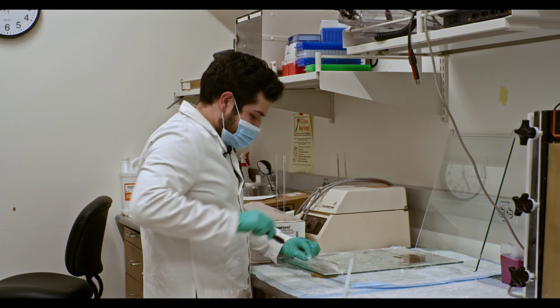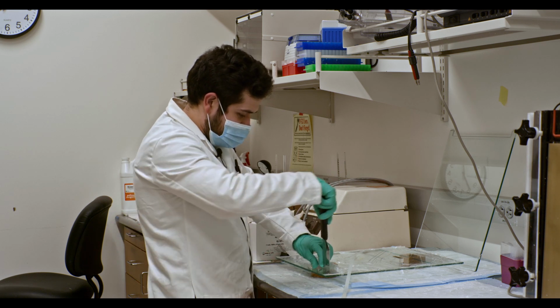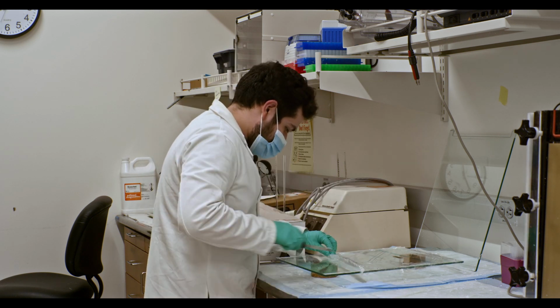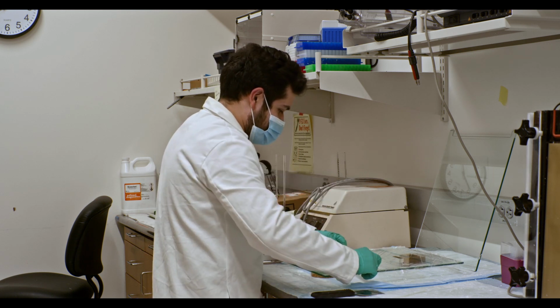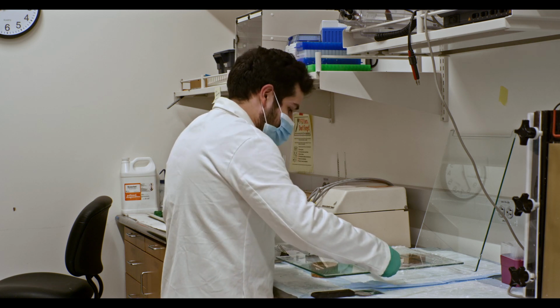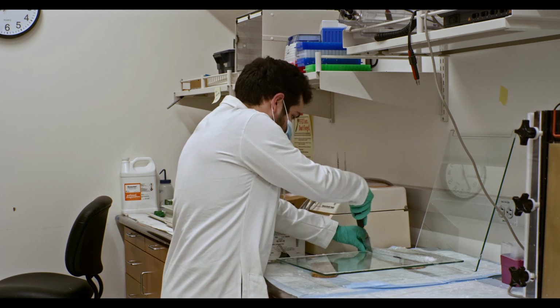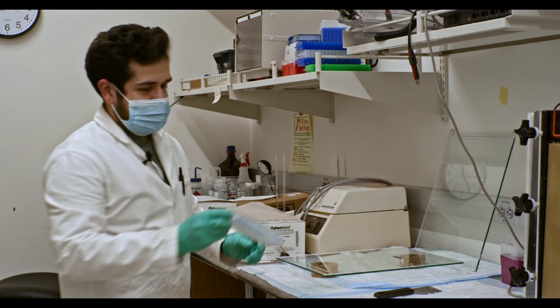What I try to do is I use this scraper, which I use to pop the gel plates open. And I try to get as much gel as I can onto that saran wrap, roll up the gel in the saran wrap so it can come off nicely. Also, what you should know is that if you effectively take off this gel, there shouldn't be any radioactive material left on these glass plates. You can use a Geiger counter, which you should have on hand, to tell you that you have no more radioactive material on this gel plate. If there's ever a loose piece of gel, just keep scratching it off, putting it on top of the saran wrap. Then we throw it away into the radioactive waste.